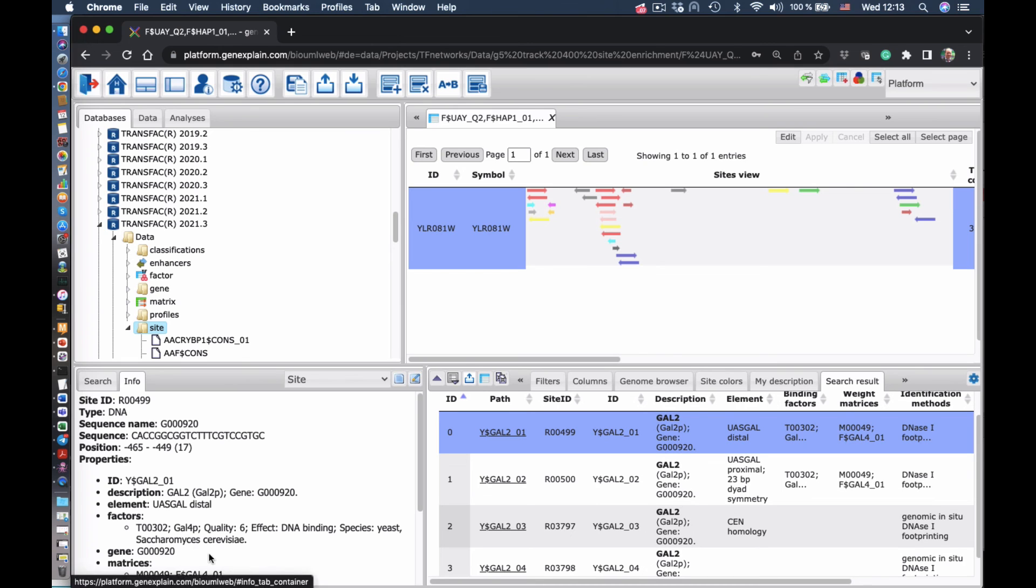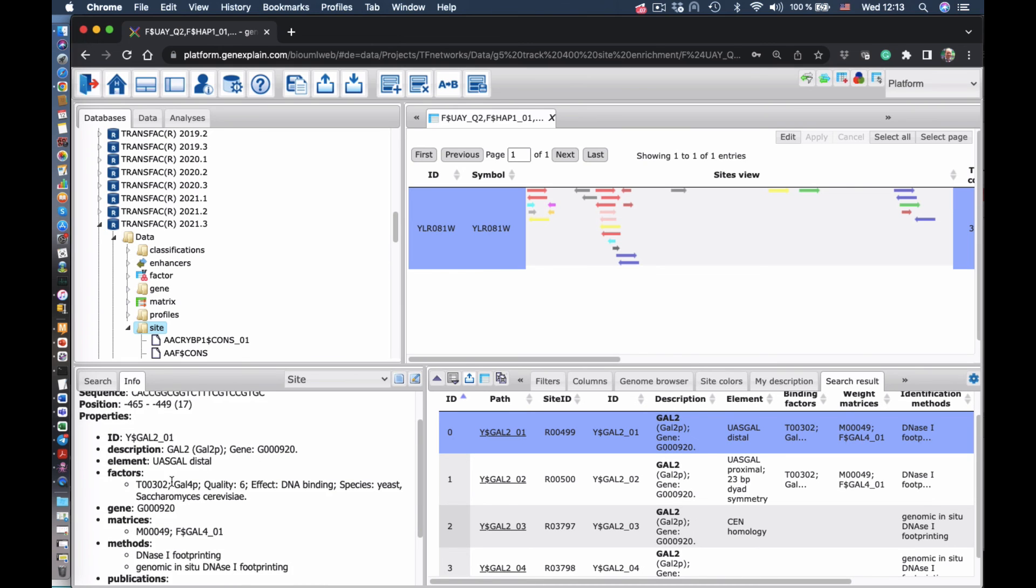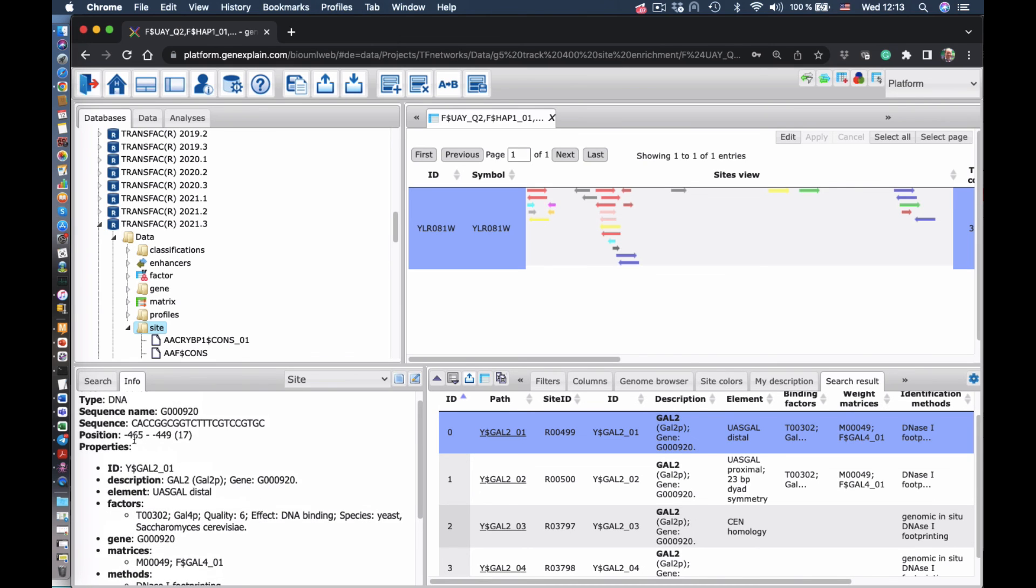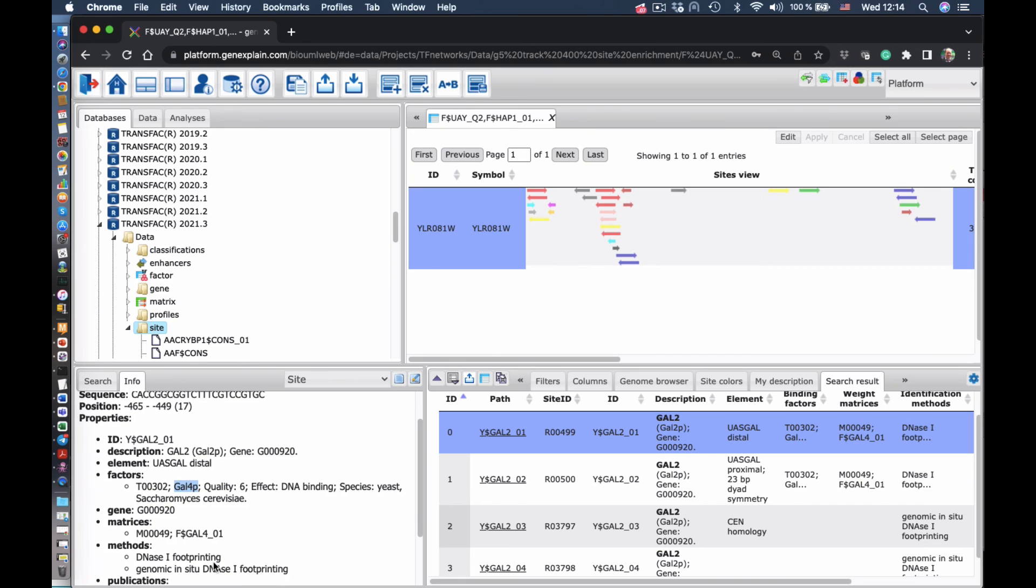And as you can see here, the first site is exactly the site which was found by the match program, the site for the transcription factor of GAL4P. Thank you very much.